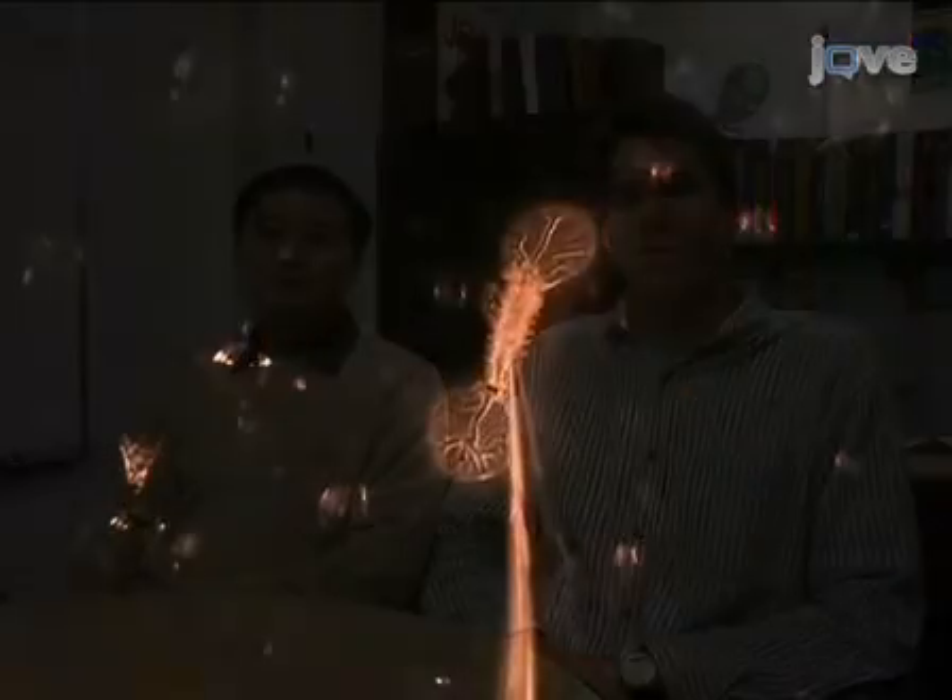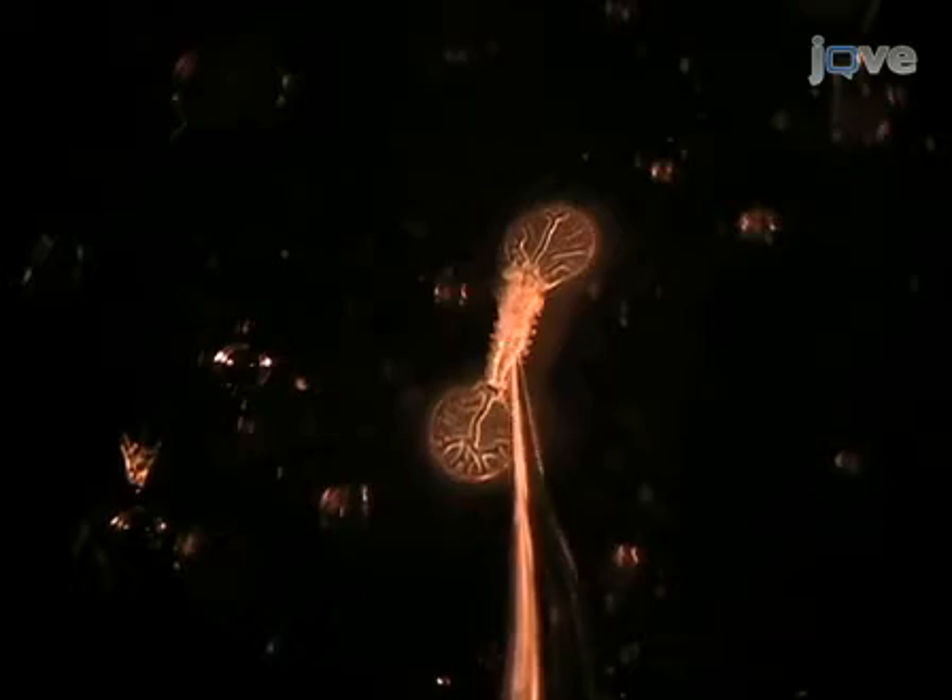I'm Dave Featherstone from the Department of Biological Sciences here at the University of Illinois at Chicago. I'm Kai Yun-Teng from the lab of Dave Featherstone in the Department of Biological Sciences at the University of Illinois at Chicago. Today we're going to show you how to collect and manually dissect late-stage embryos from Drosophila. We use this procedure in our lab to prepare for electrophysiological testing of Drosophila neuromuscular system development and function. So let's get started.